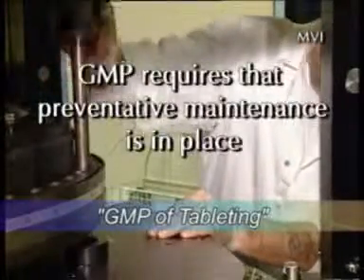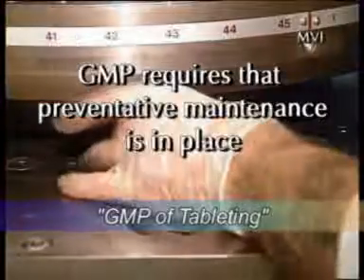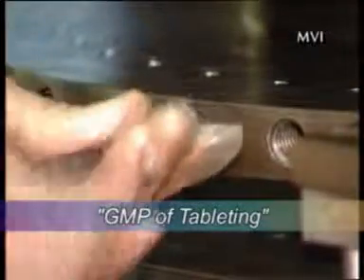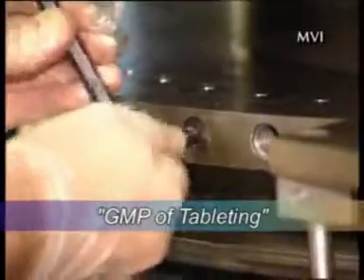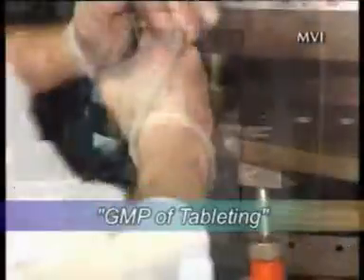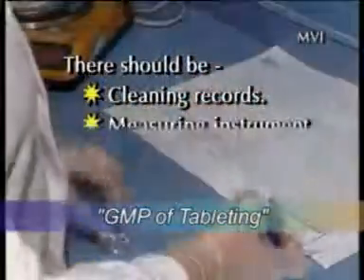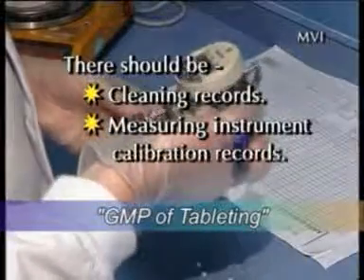GMP requires that preventative maintenance is in place and that responsive maintenance is recorded and is not excessive, because that would be an indication of more deep-seated problems. There should be cleaning records, and all measuring instruments should have been calibrated and be within calibration.